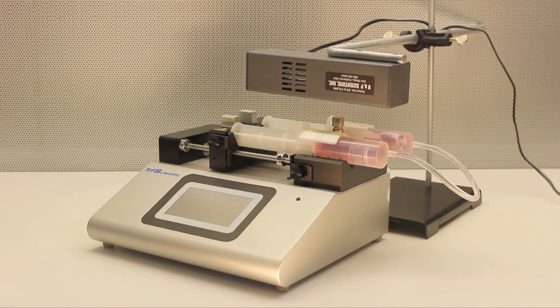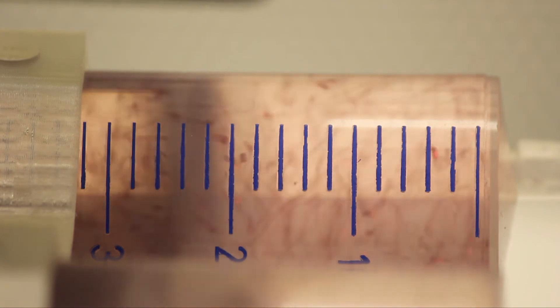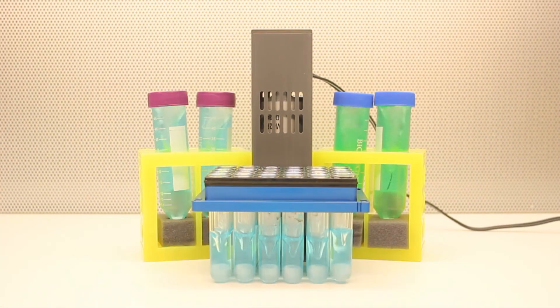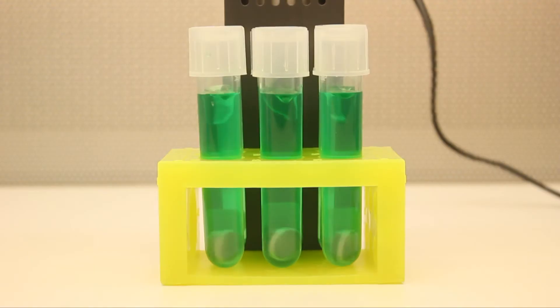Coupled with stir discs, it can stir in syringes even while dispensing on an automated syringe pump. It can also be used to mix samples placed to the sides of the stirrer, allowing many different samples in different tube-size vessels to all be identically mixed at the same time.